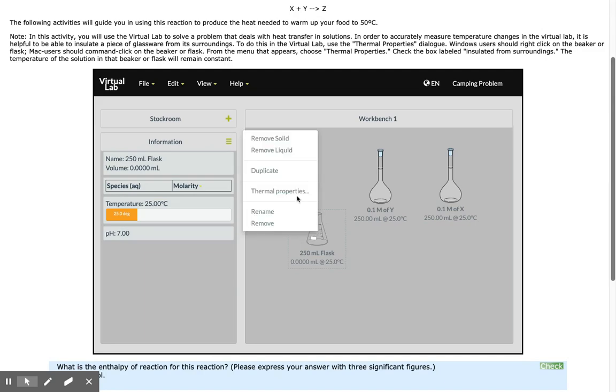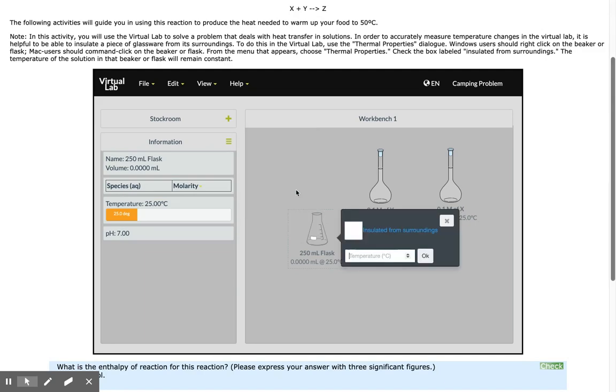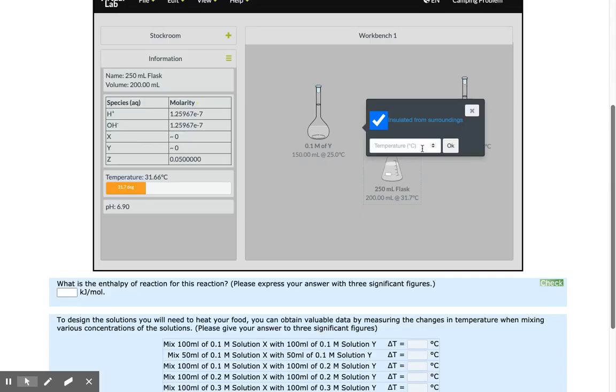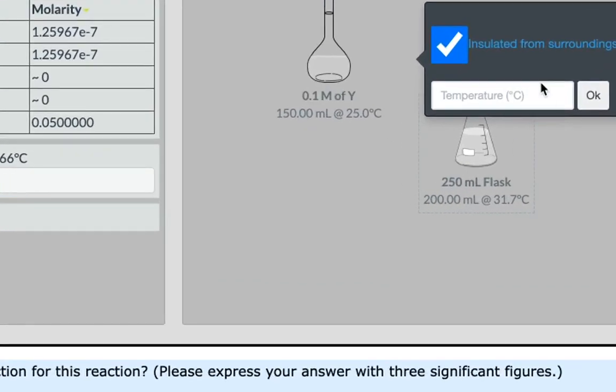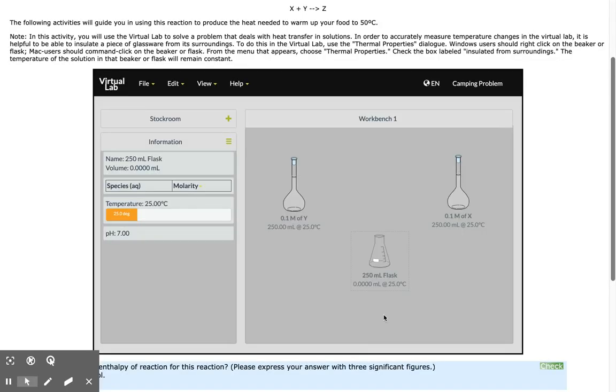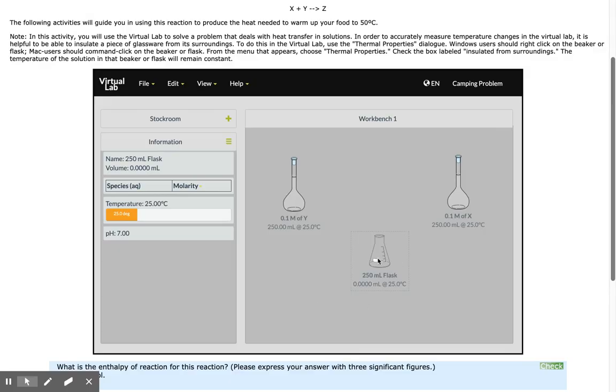To conduct an enthalpy experiment, I need to first insulate my container. This is acting as our calorimeter. Once you've insulated your reaction chamber, you're ready to start taking measurements. The starting temperature is 25.00 degrees Celsius.